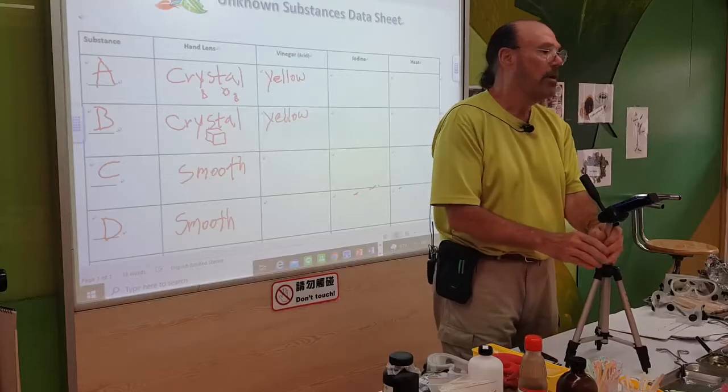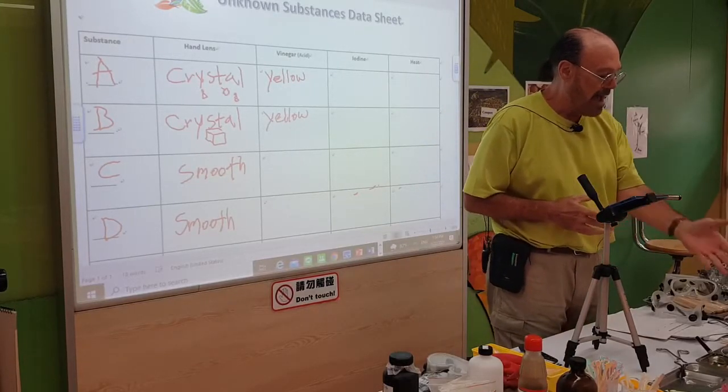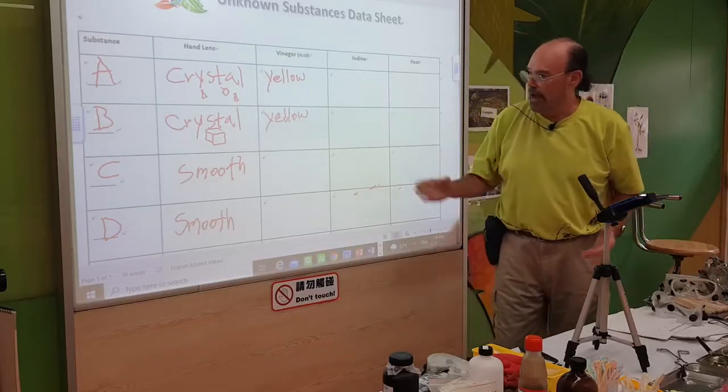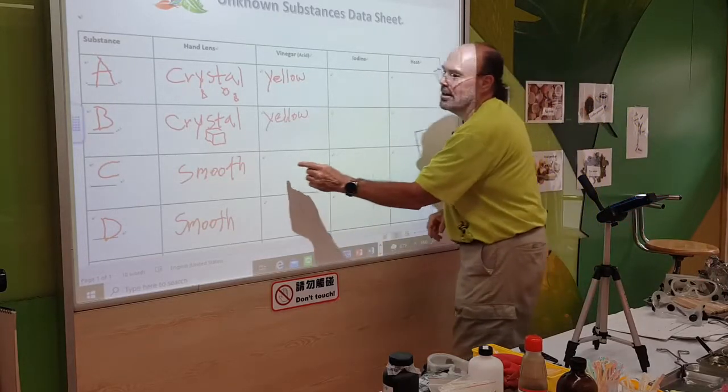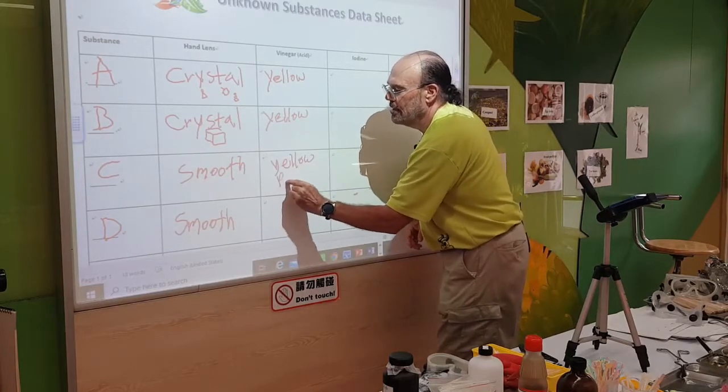All right, now, next what we have to do, we can't contaminate the acid and the iodine. Well, let me finish writing here. Let's say yellow and bubbles.